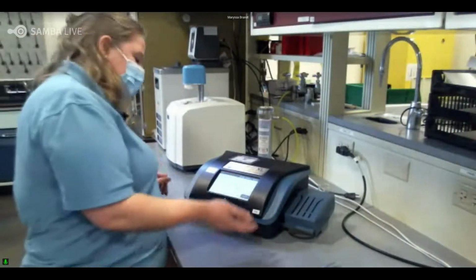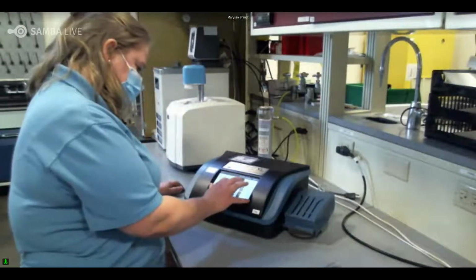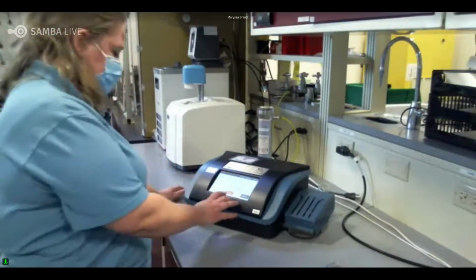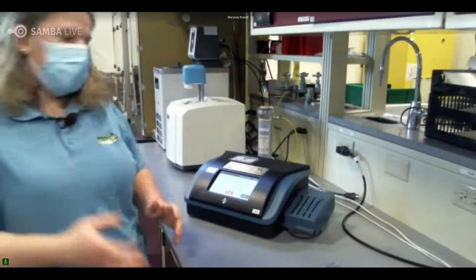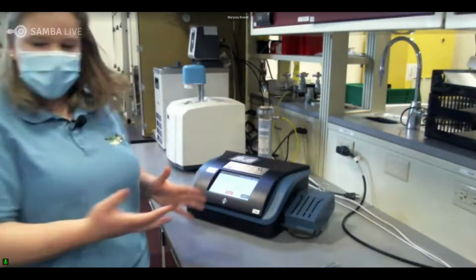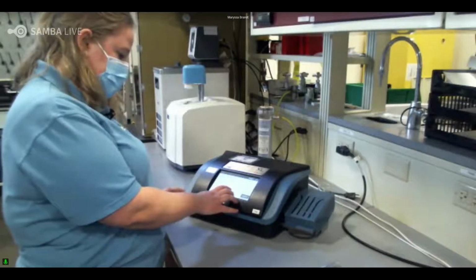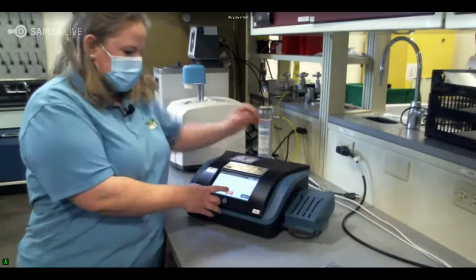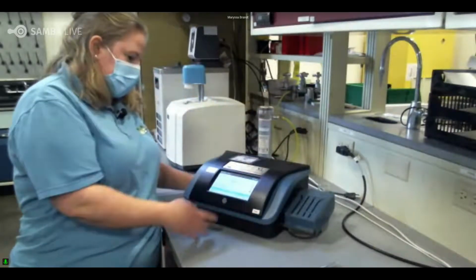So I already measured this weight, but the weight is 0.25 grams because that's what a substrate is, and I also already measured it via a scale. So then, once I enter the weight, it's telling me, okay, we're ready for your sample. Go ahead and click test. So I'm going to click test, and it's going to say insert your vial now. So I'm going to go and insert my vial, which was already done, and the lid is down. So now we're going to test it.